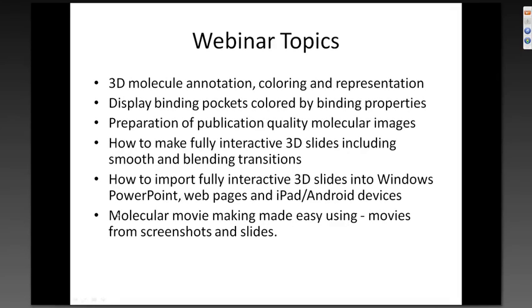And then show you how to make molecular movies based on the slides that you made or directly from a screenshot.